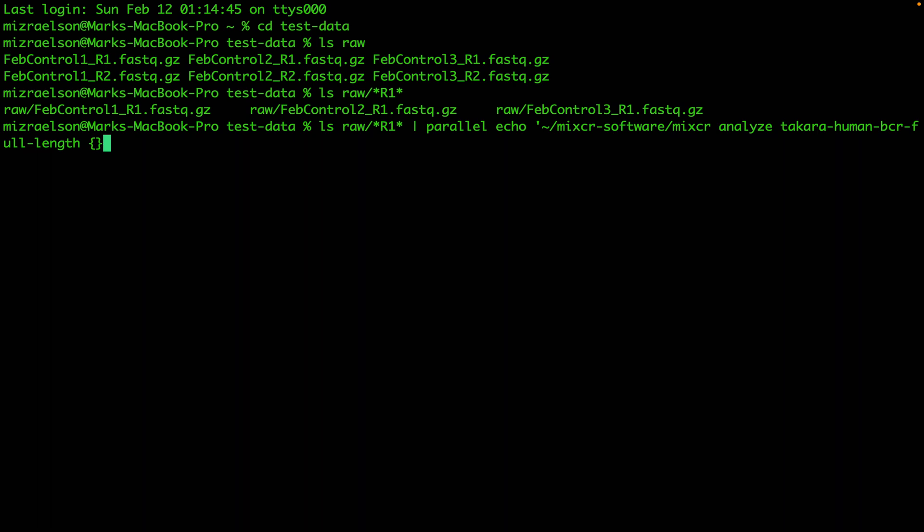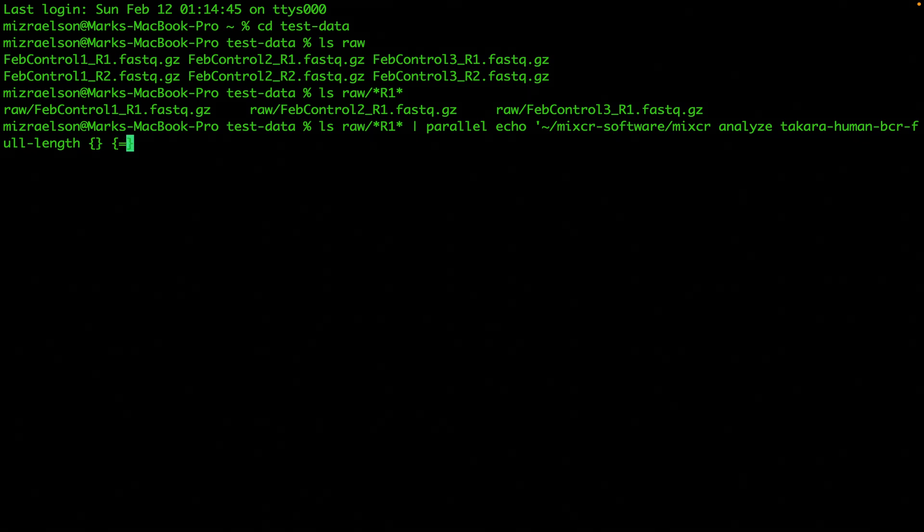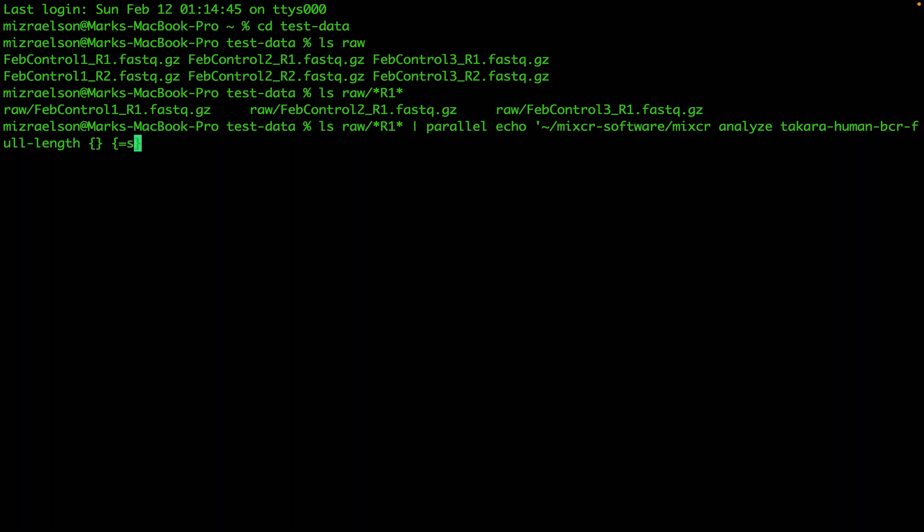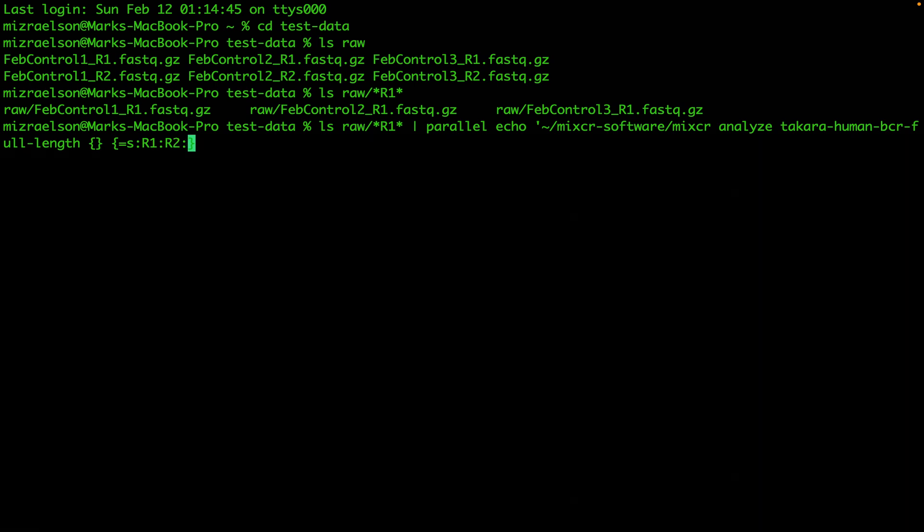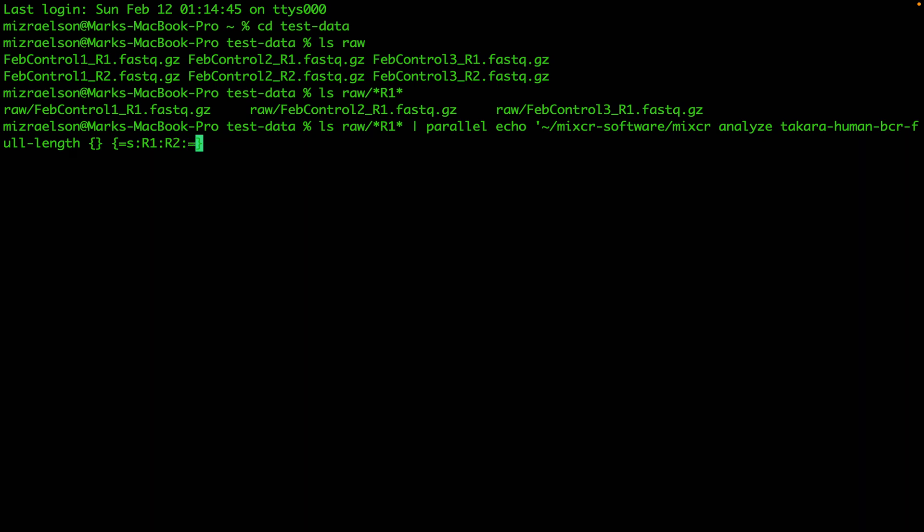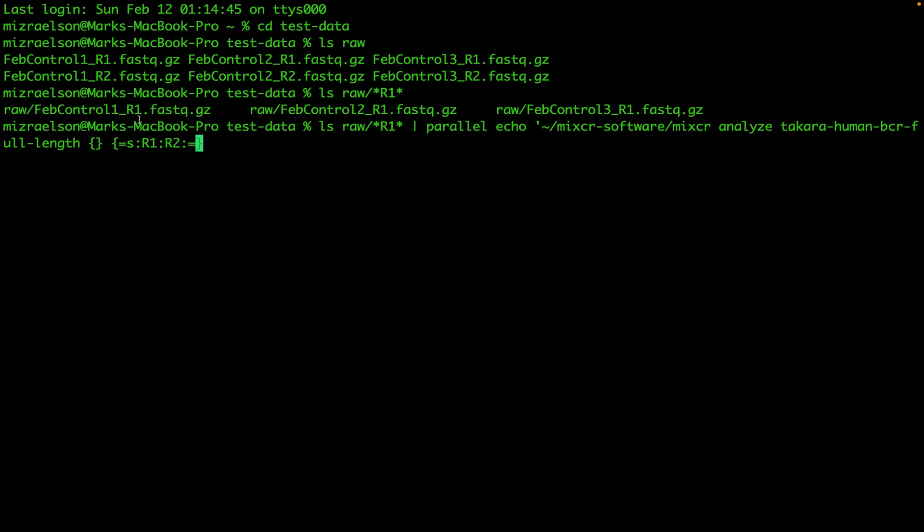To provide the second input file, I'm going to use the same curly brackets and substitute R1 with R2. Which means that in that string that we have here, which will be passed down to parallel, we will substitute R1 with R2 and that's how we will get the name for the second input file.